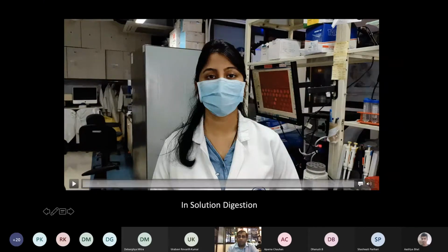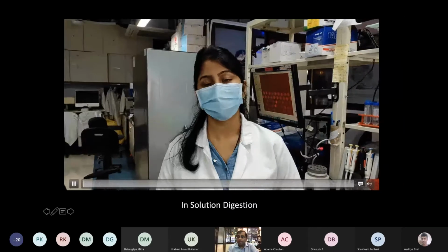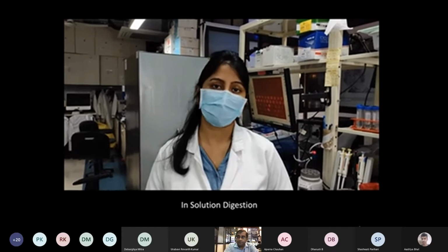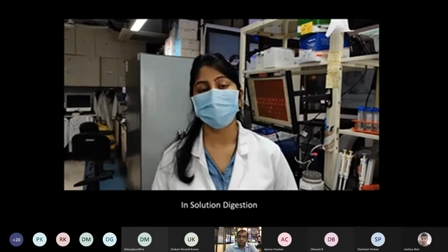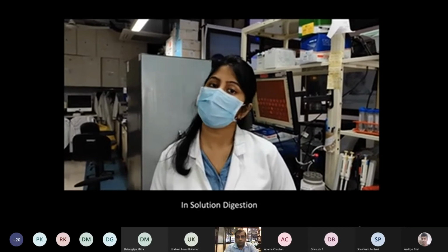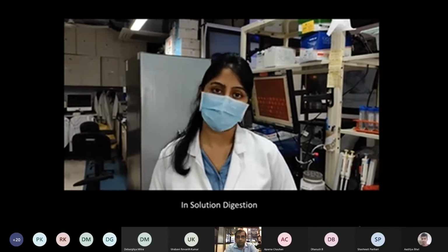The second alternate way of doing this could be in-solution digestion, and let's see this. For mass spectrometric analysis, in order to identify the proteins in a sample, peptides are required. For getting the peptides, the protein sample should first be digested. Protein digestion can be performed in a gel-free or a gel-based manner. We will show you how to perform the in-solution digestion, that is the gel-free procedure.